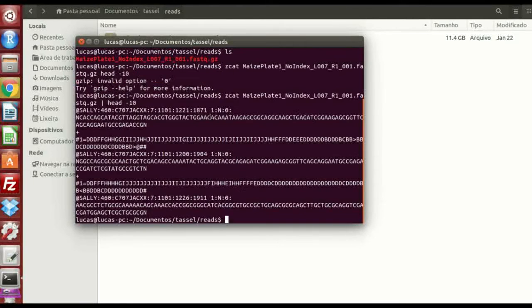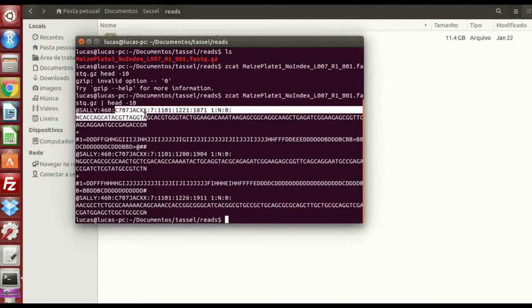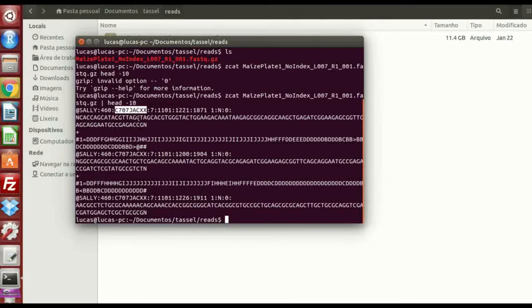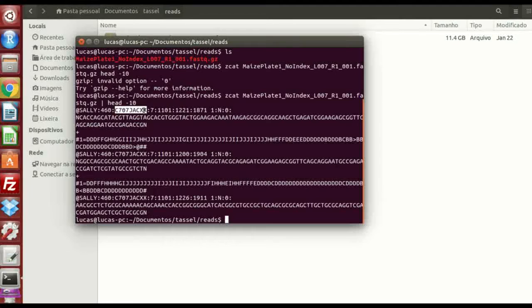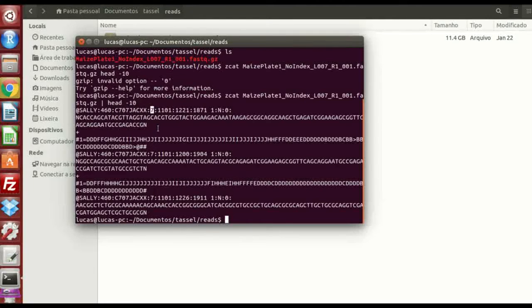This is how your FASTQ file is, this thing here, c707jacxs, this is your flow cell name. So you're gonna take note of this, and put for each genotype in your key file, you're gonna put the same name. The same thing here, seven is your lane. Now you have this, you can close.